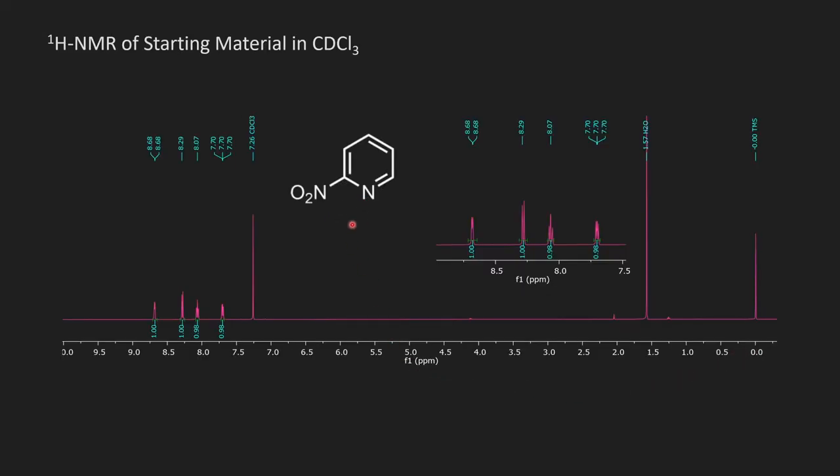The first NMR is the starting material, this is the 2-nitropyridine. You can see that there's four protons from this one, two, three, four positions on the ring. These all have nice splitting patterns, which isn't super relevant here, we're just showing that this is clean starting material. The things I want to highlight here include the chemical shift of these peaks, 8.7 and 8.3. You can just remember those two, as we'll be looking for those spots in the product.